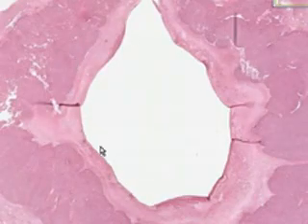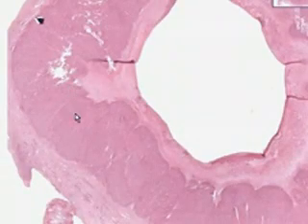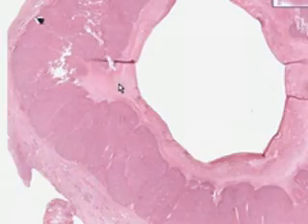which is why there's no luteal tissue in here. But the endocrinologically active cells are these foamy cells all along here. Sure, there's a little connective tissue and a lot of blood vessels in between them. And then there's a lot of fibrous tissue towards the outside. There's probably a lot of hemorrhage towards the inside.